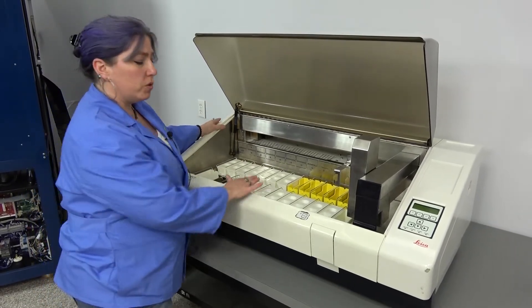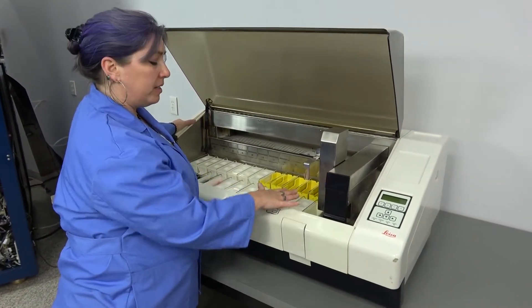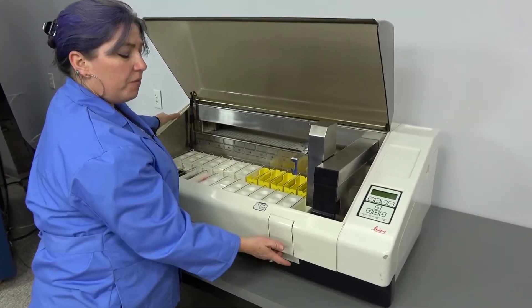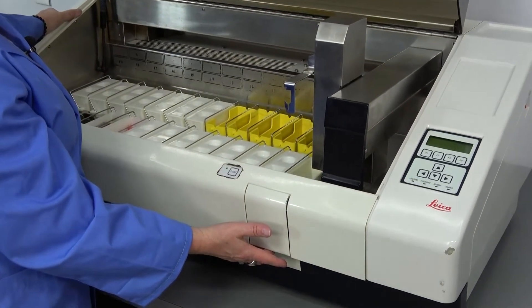In order to run these you can use any kind of baskets that you would like. The baskets from Lyco fit in here properly. If you would like to use a different brand you will have to contact Lyco for an adapter to make them work.